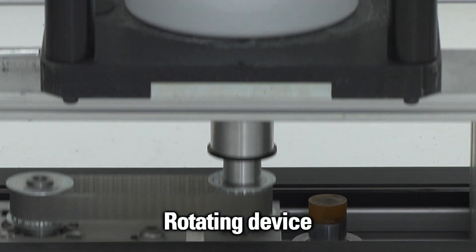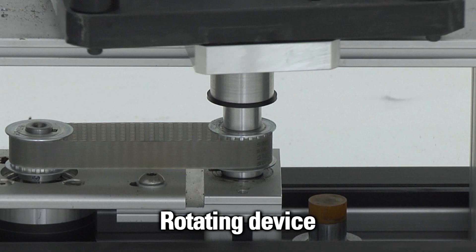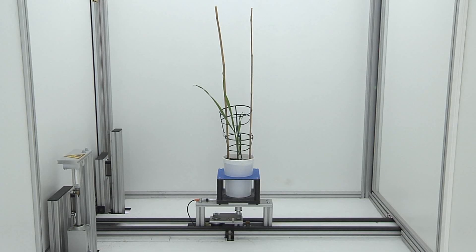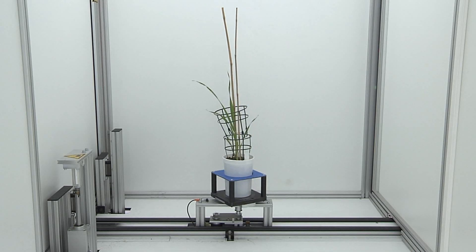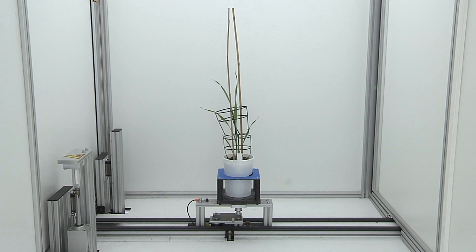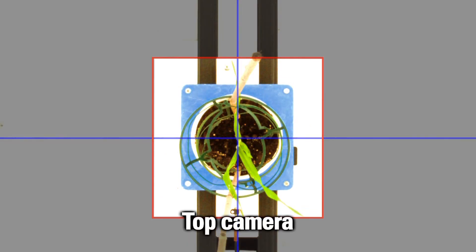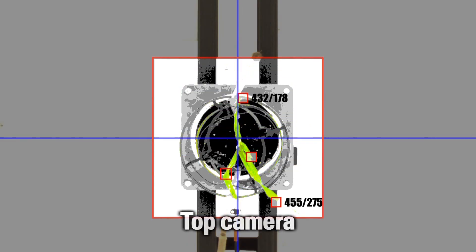Turning the plant provides multiple imaging from different sides for 3D vectorization, and additional top cameras complete comprehensive 3D information.